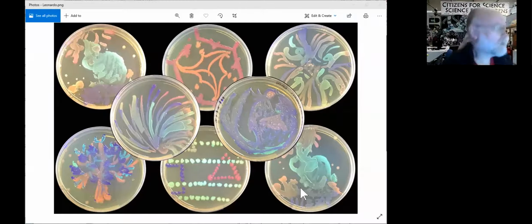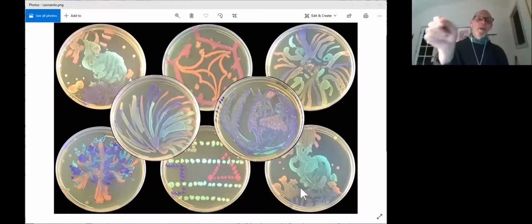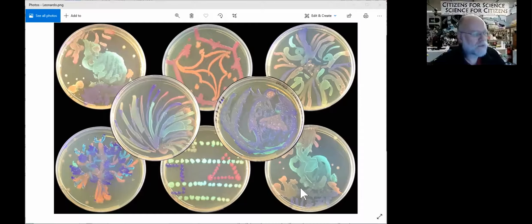This was all using paintbrushes to apply the different strains, and they just went over the same area that they had already covered. So you use physical paintbrushes. I don't think they were intentionally mixing like you would do on a palette with ink. I think they were just going over the same area that already had some strain on it.